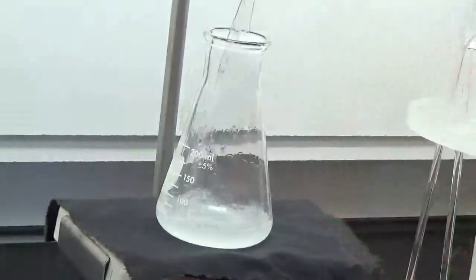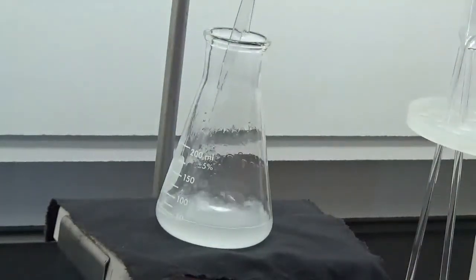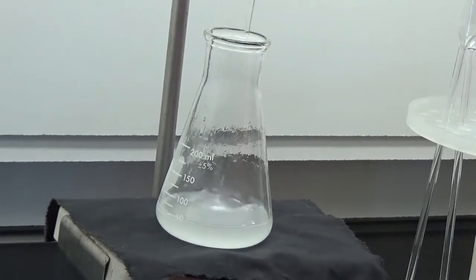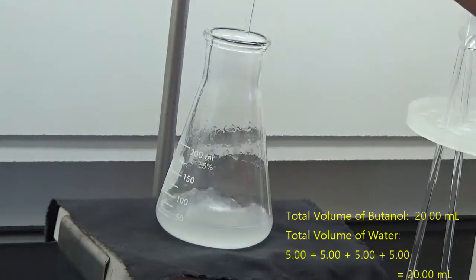Watch it cloud up. Look at that. It clouds right up. So it's clear that adding the acetic acid helps butanol and water mutually dissolve. Right?